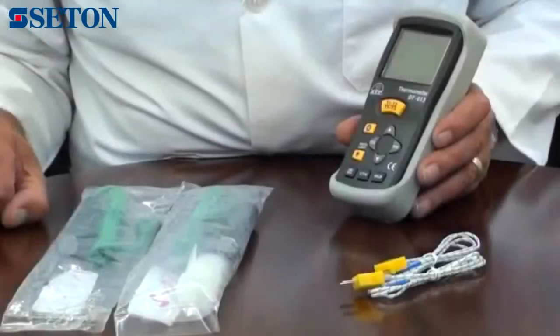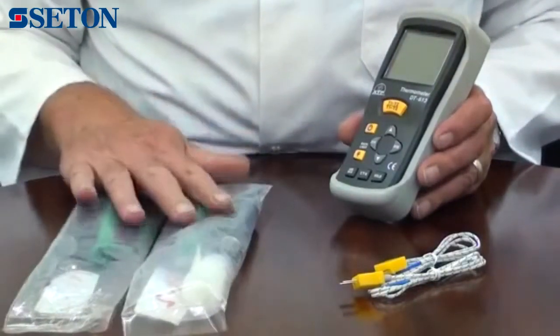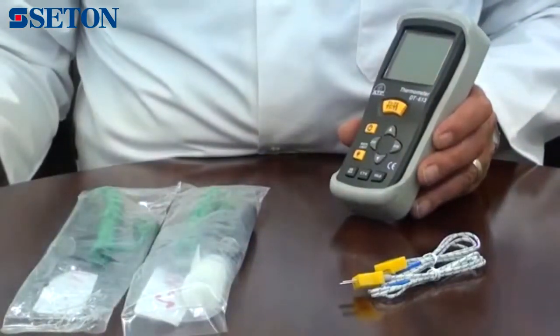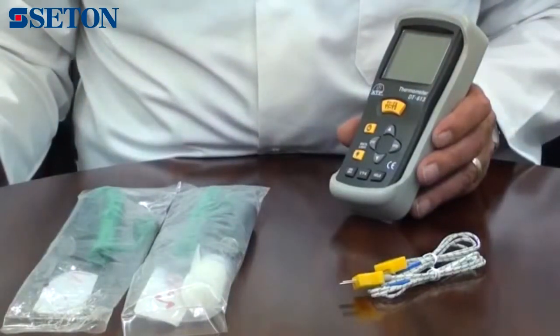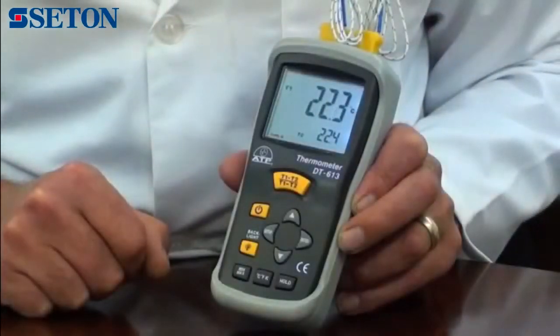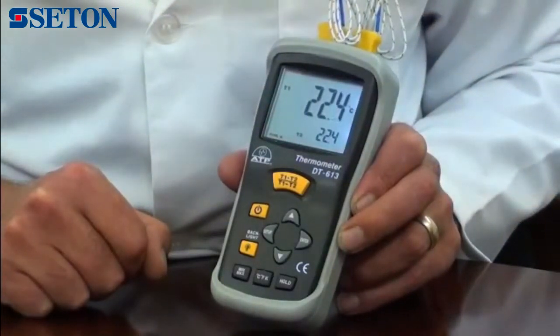The thermometer is ideal for many applications as we offer a range of interchangeable plug-in probes. These cover typical applications such as air, liquid, penetration, immersion and surface temperature measurements. It has a measurement range from minus 200 degrees to 1372 degrees C.